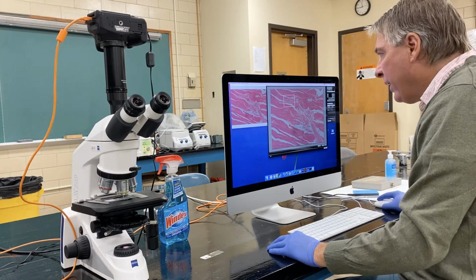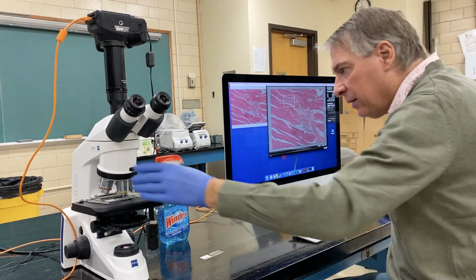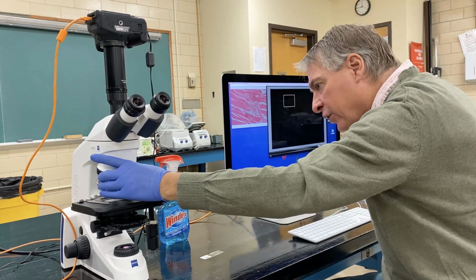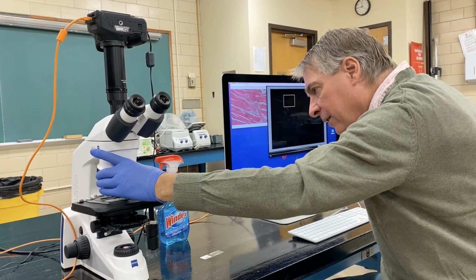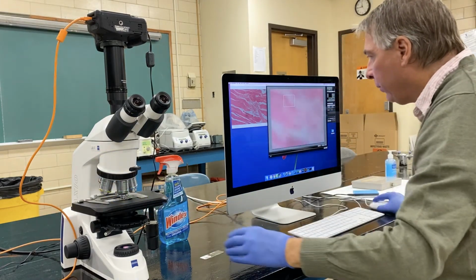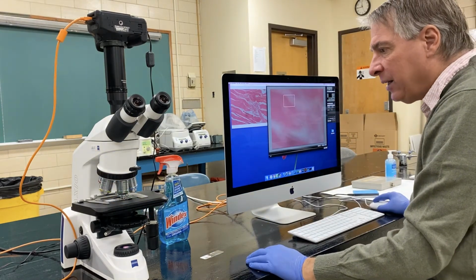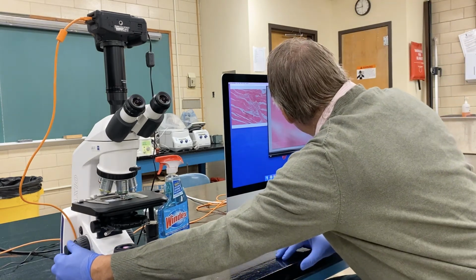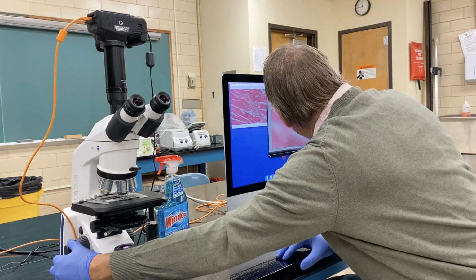Now, if I want to move up from the 10x objective to the 20x objective, I can turn the objective turret so that the 20x objective is now in place. The 20x objective has a green stripe on it. And now I can focus for the 20x objective.